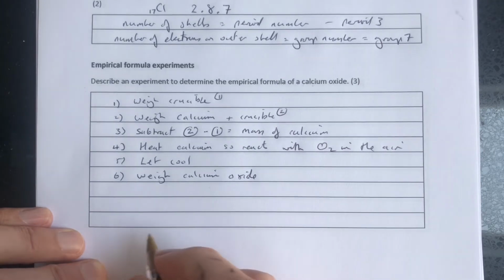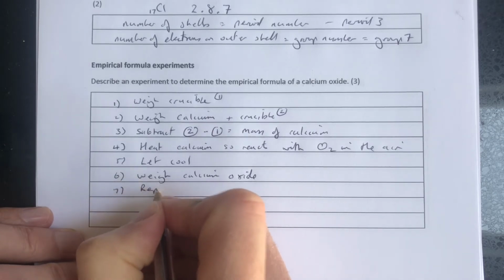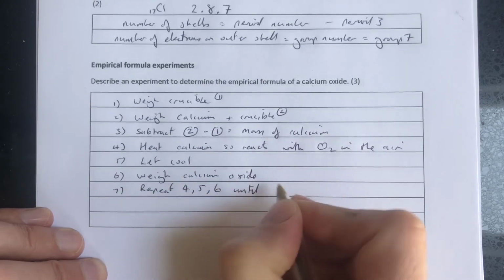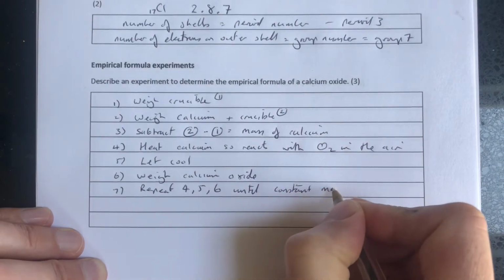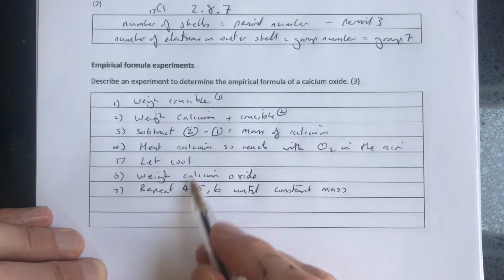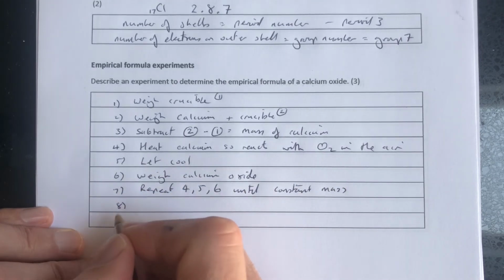Okay, now we've done that, we're going to repeat 4, 5 and 6 until constant mass, because we don't know all the calcium has reacted. So if we heat it again and the mass goes up again, we know it hadn't all reacted. So we keep doing that until the mass is constant. That tells us that all the calcium is reacted to make calcium oxide.